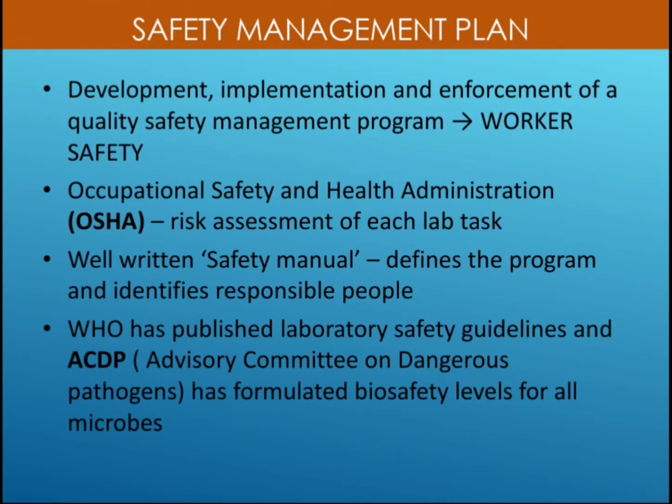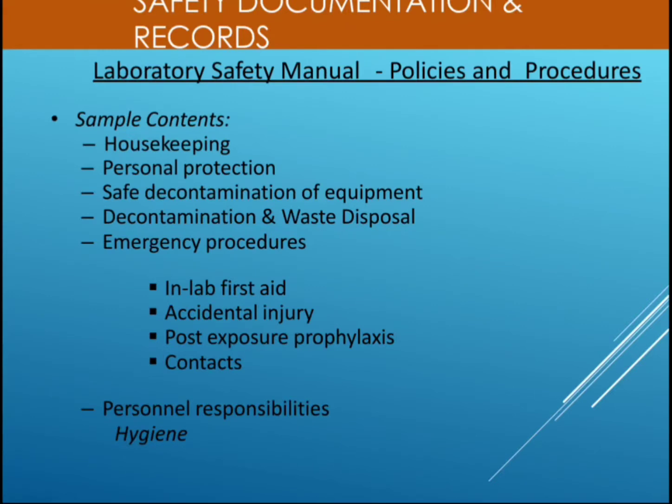Then WHO has published laboratory safety guidelines, and the ACDP, Advisory Committee on Dangerous Pathogens, has formulated the biosafety levels for all the microbes. Then the safety documentation and records: the laboratory safety manual and the policies and procedures.